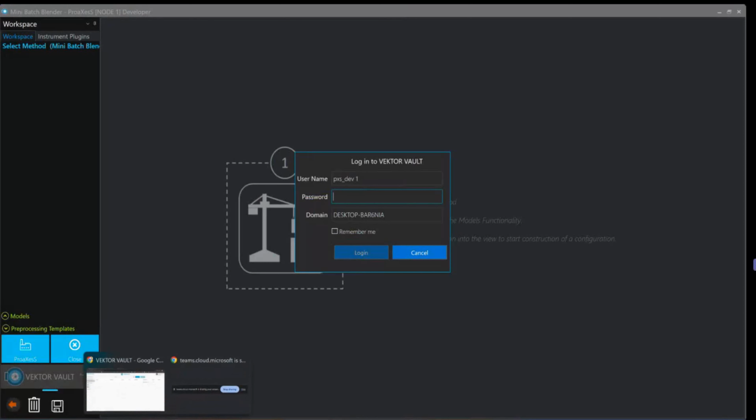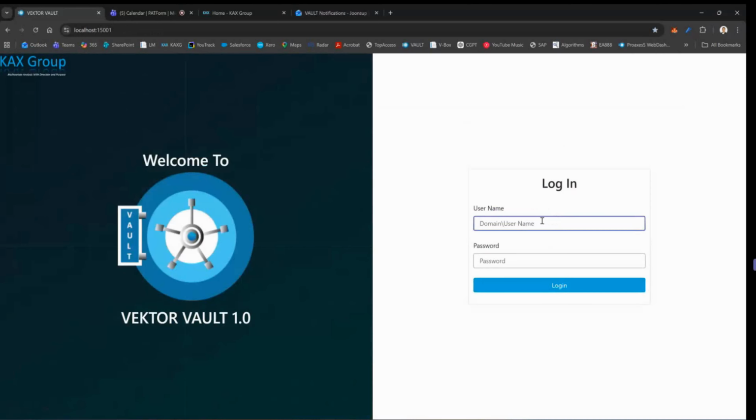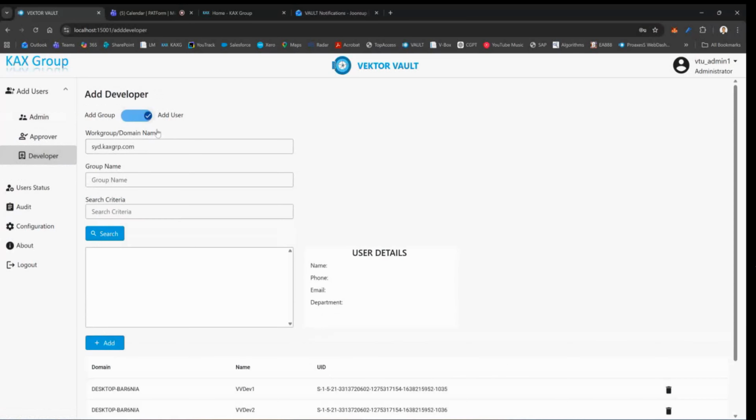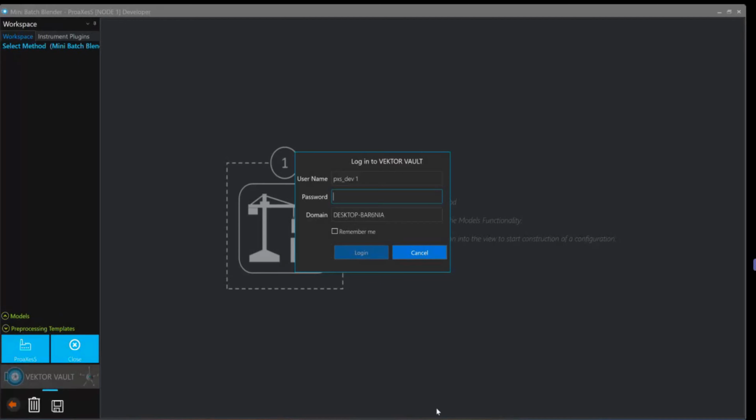Might have to log into Vault here. All right. Admin. Yay. Okay. Let's just find. Okay, who's connected? VTU underscore dev1. Let's try that.